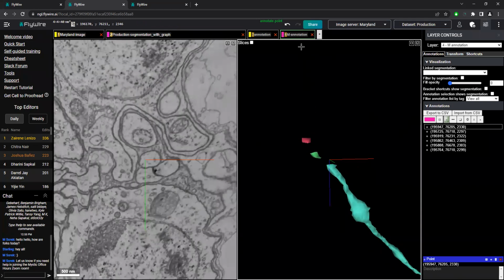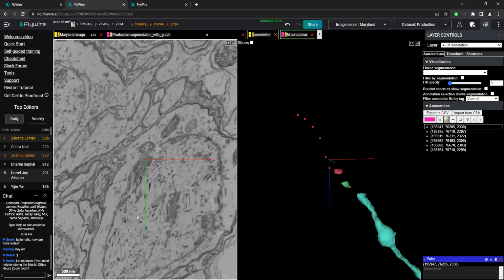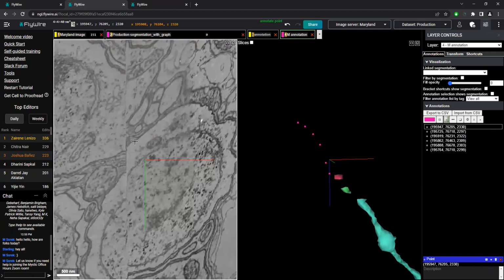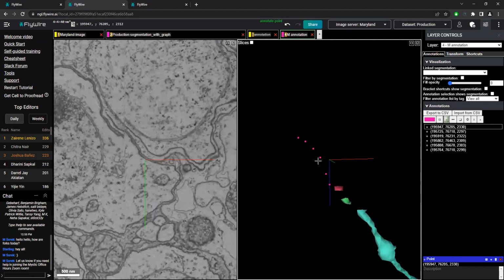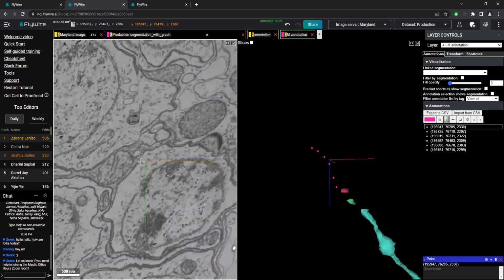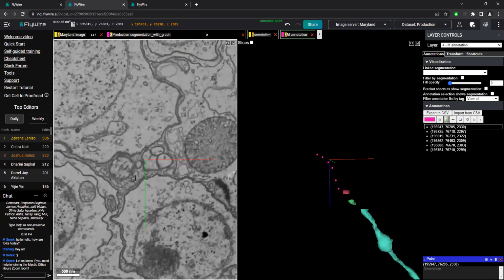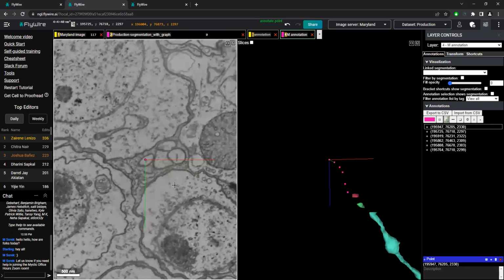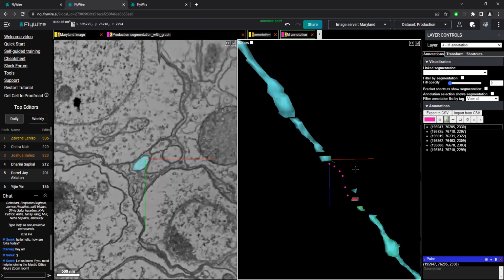So I've gone along and scrolled and just dropped annotation points where I see that little spot in relation to these three other branches here. I know it's kind of bouncy all over the place. And as you can see, I kind of was like, okay, there it is. And I see it's going across that fold. It's back here. We still have our little face to the right of it. And I've just dropped an annotation point where I want until I get to the very end here. And I scroll and I finally can see that I can select the next piece and add that in.